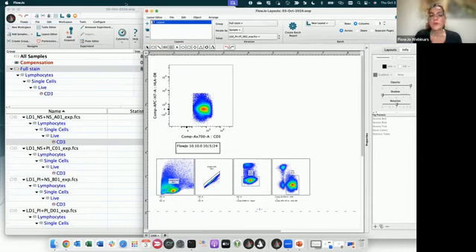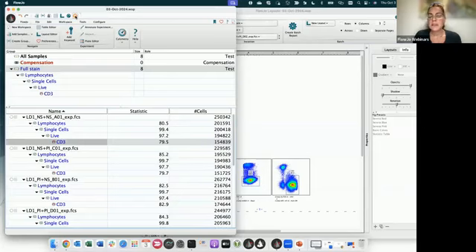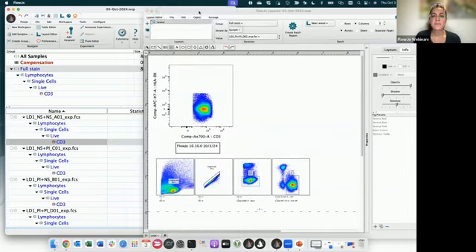Okay, looks like another question came through. What is that BD icon on top of the FlowJo left screen? That would be this one. If you ever wondered what the BD icon on the top left corner of FlowJo is, this is a connection to one of our platforms.